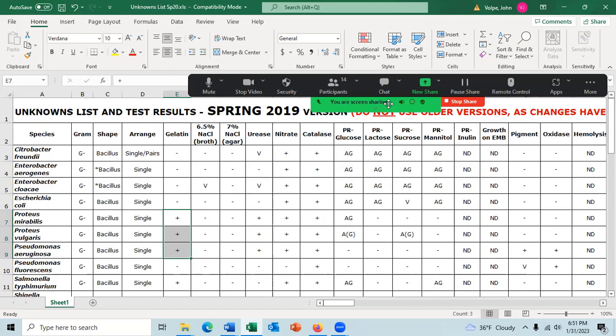Those are basically the results of the gelatin test for those species.